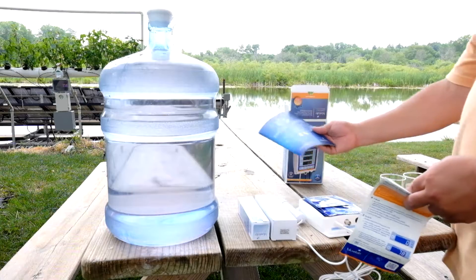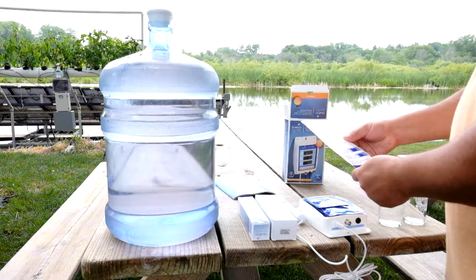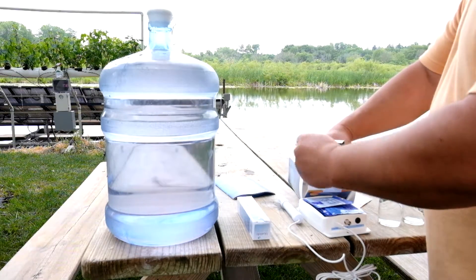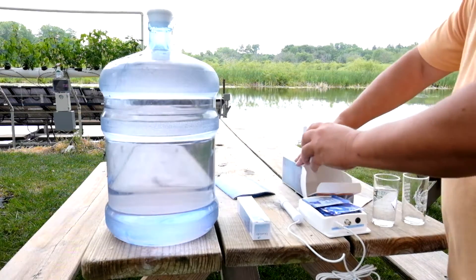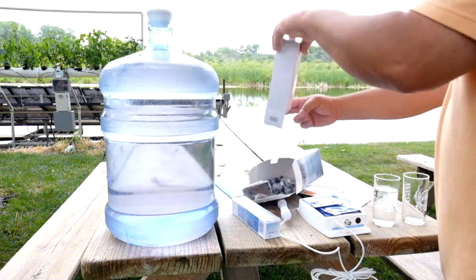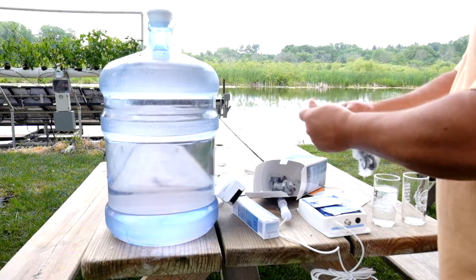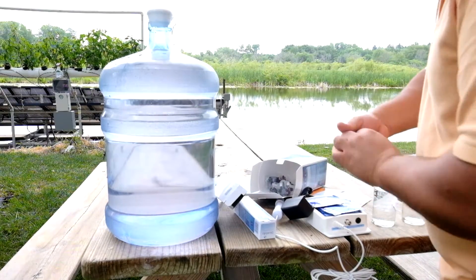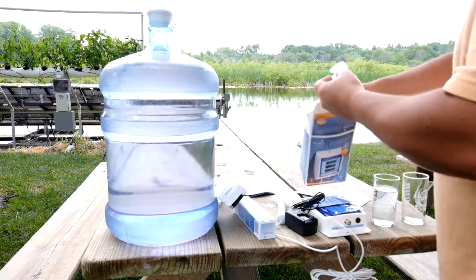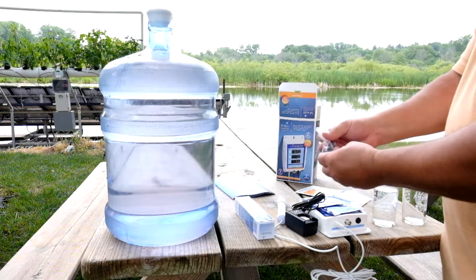I'm just going to show you how this thing gets calibrated. It has a standard calibration for most pH meters — you put it into the 7.0 solution that Blue Lab supplies and calibrate that first, then you rinse off the probe, put it into some clean water, and then put it into the 4.0 solution, which gives it that range.